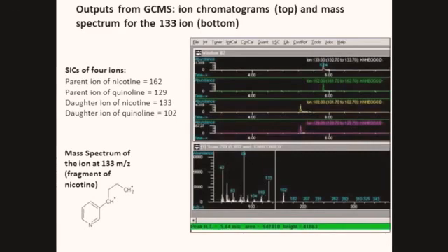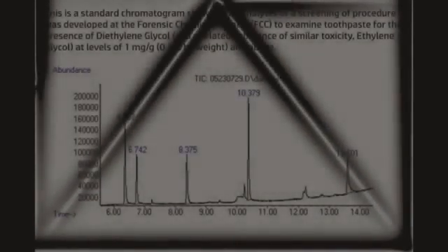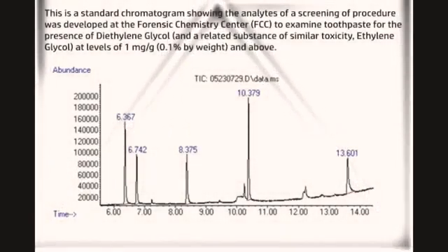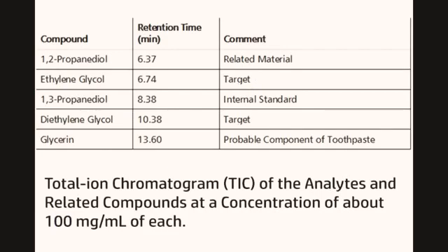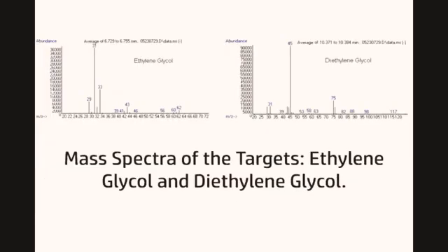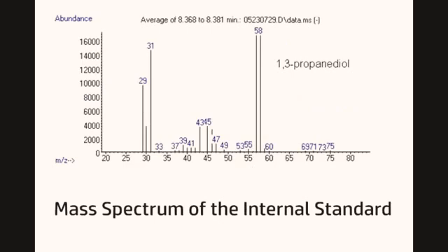When a complex sample is separated by GCMS, it will produce many different peaks in the gas chromatogram, and each peak generates a unique mass spectrum used for compound identification. Using extensive commercially available libraries of mass spectra, unknown compounds and target analytes can be identified and quantified.